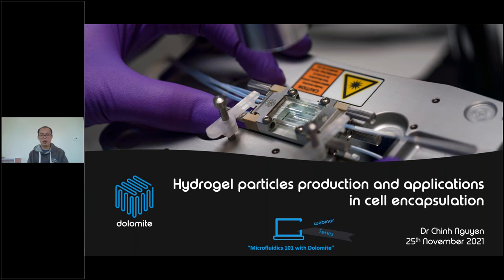This webinar is one of a series we call Microfluidics 101 with Dolomite. This webinar series will be delivered every last Thursday of each month throughout 2021. Today we will talk about the topic: hydrogel particle production and application in cell encapsulation.